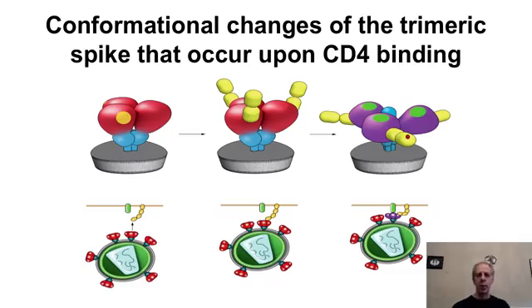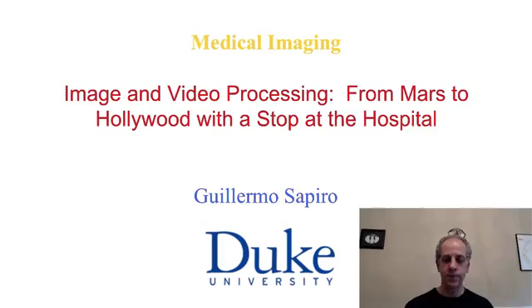When we talk, for example, about activity classification, that was to do in the computer something that the human knows how to do. Here it is to do something that the human cannot do. We cannot see the 3D shape just from those projections or from those tomography 3D reconstructions. We need to do this image processing. I hope you had fun. This is an exciting area, and this is just the tip of the iceberg of research in image processing, viruses and microscopy. But it's an illustrative example of the power of image processing to solve real problems.